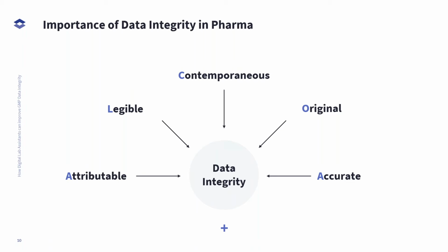So to understand data integrity, in the morning when I prepared for the presentation, I wrote down a sentence for myself, which makes it, for me at least, very, very clear. So the extent to which all data is complete, consistent, and accurate throughout the data life cycle from initial generation, and that's very important, throughout recording, processing, including transformation of data from manual to computerized systems. So we are always talking about computerized systems. Throughout backup phases, use, retention, archiving, retrieval, and finally to destruction of the data.